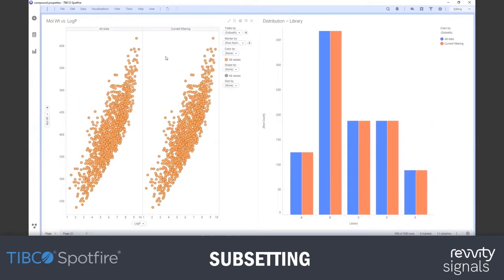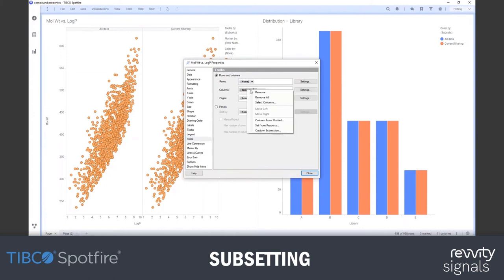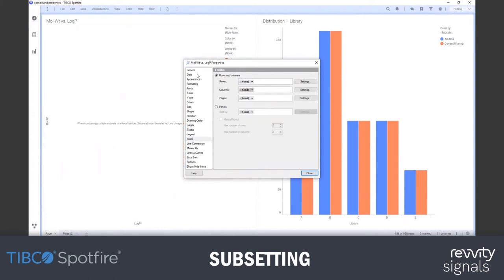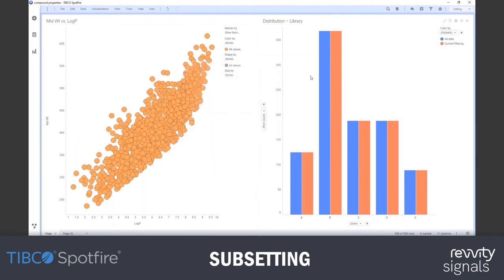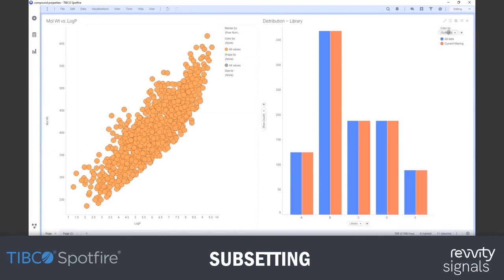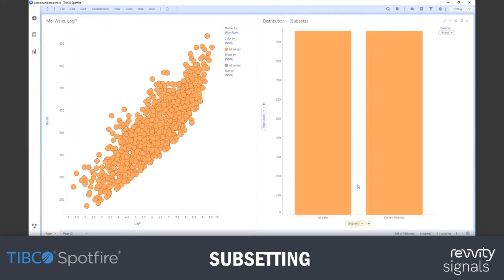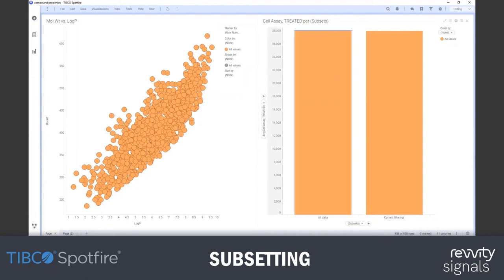Let me remove my subsets from trellising here, just to tidy this up a little bit. So I'm going to turn off the subsets in here. Okay, so I see all my data. Just want to make sure I'm using marking. Yep, great. So down here, I'm going to use subsets and put it on the axis. Actually, you can pick it up here and just drag it down. So I've got a bar showing me the results for all data and a bar showing me the results for current filtering. What I'm going to look at is my average assay result for the different selections.